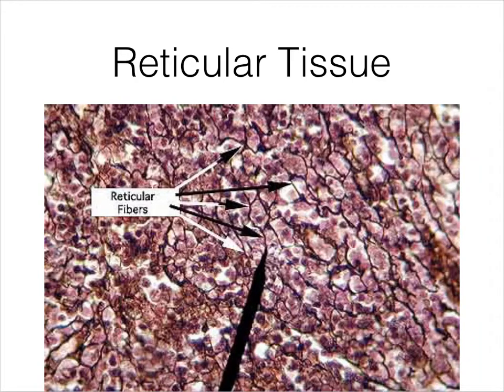They're not permanent residents. So the features that you're going to look for to identify reticular tissue is a relatively high cell density, first off. So we see cells here, here. If you look around for the nuclei of cells, you see a lot of cell nuclei. Most of these in this case, because this is a lymph node section, I believe, are going to be blood cells.